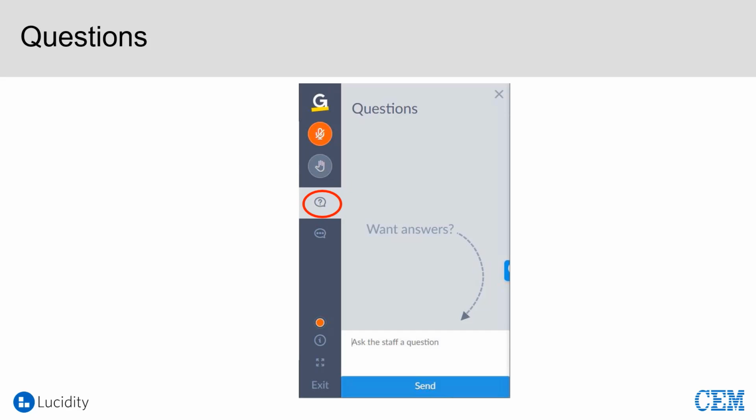My opinion today, and I'm going to really hedge on this, is that it may end up being method specific as we really get into optimization for greenness, as well as productivity and things like sensitivity. Usually we think about sensitivity and productivity, and now we're adding greenness to that. I think we're going to probably see a little bit of both. Some methods will green up very nicely, and other methods maybe not so much.